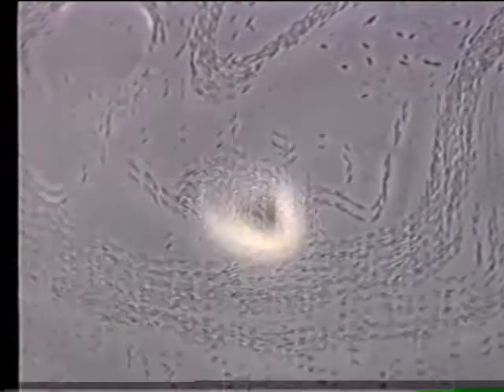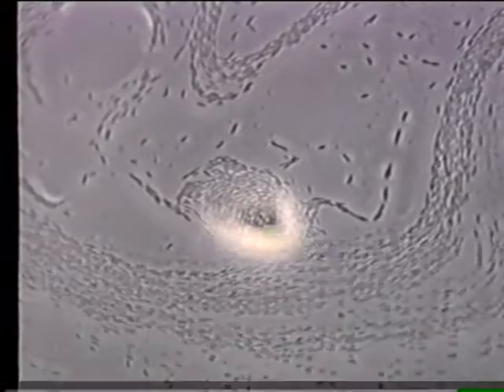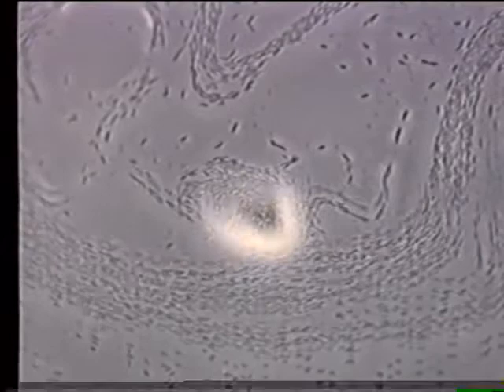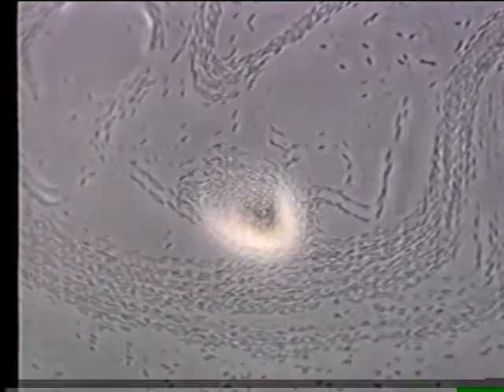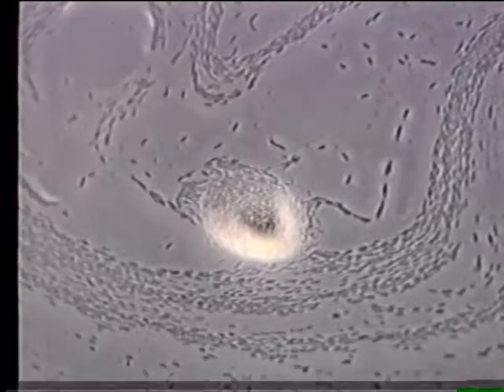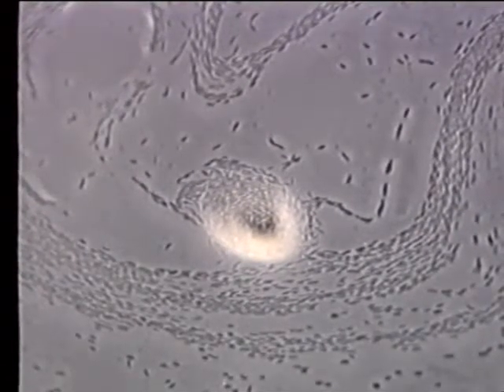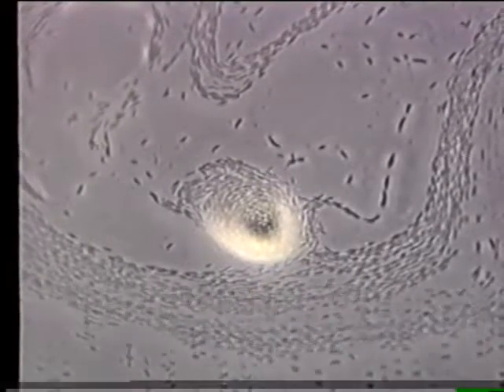As you will see, the Stigmatella fruiting body consists of a stalk supporting several sporangioles. Inside of each sporangiole, the cells convert to resting cells called myxospores. And when the nutrient is present again, the myxospores inside of the sporangioles germinate to give rise to a small population of cells called a swarm.